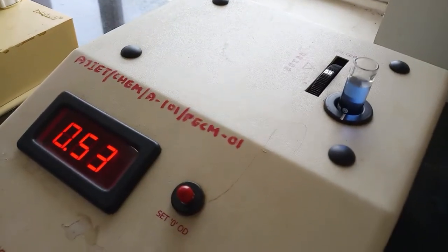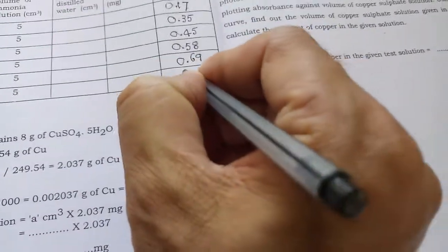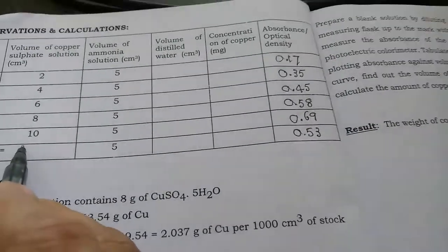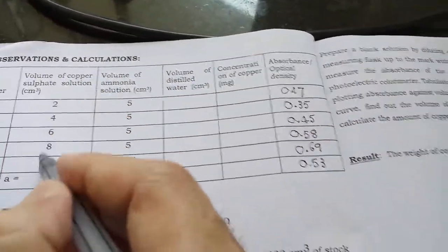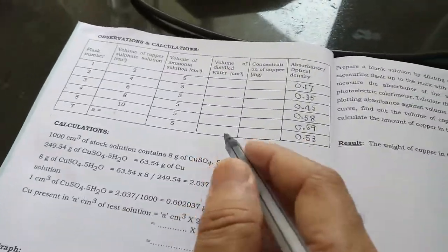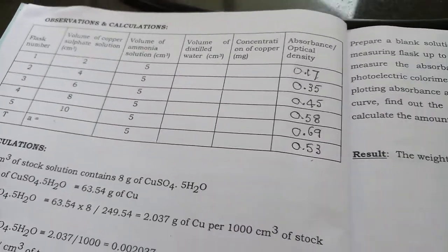For the test sample, the absorbance we get is 0.53 — that we record. The volume of copper sulfate is not known, but using this optical density and the reference volumes, we can find out what is the volume of copper sulfate present in that test solution, and later calculate what is the weight of copper present.